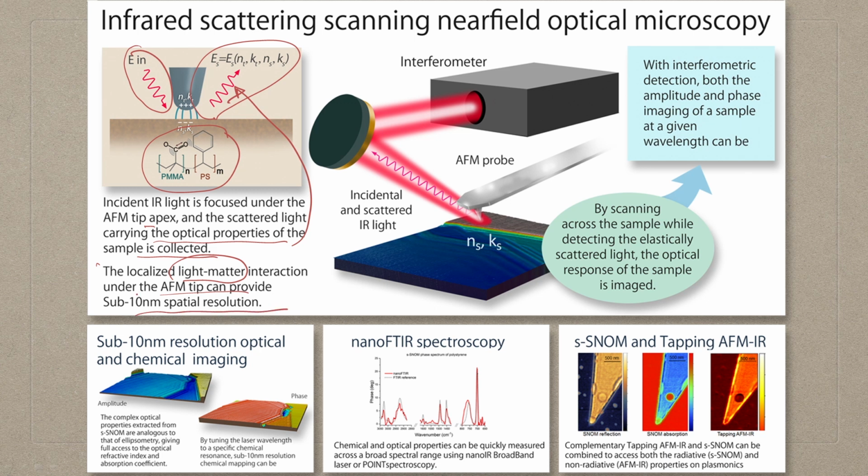a spatial resolution. So, for example, if you have a surface that has multiple different kinds of compounds or functional groups, and your tip is moving, it will be able to map which functional group is present at what part of your sample. Where you have a hydroxyl group, where you have an amine group, where you have an imido, azo, where there is a sulfur, and so on and so forth. You can figure it out, right?